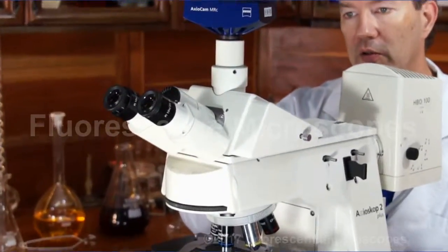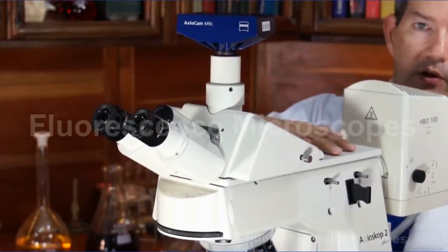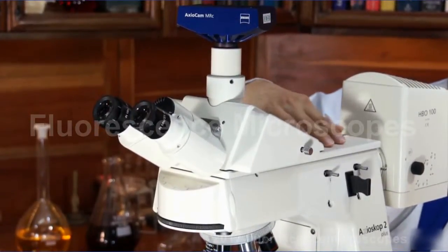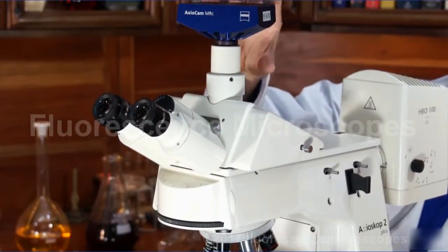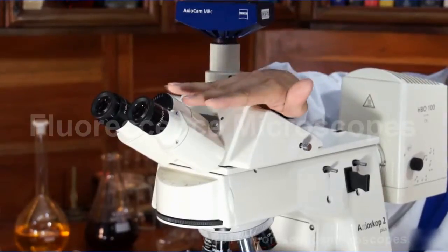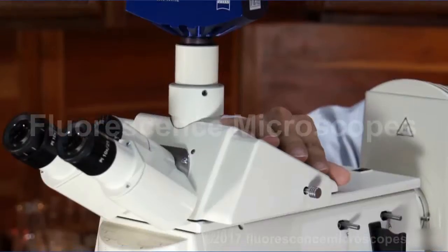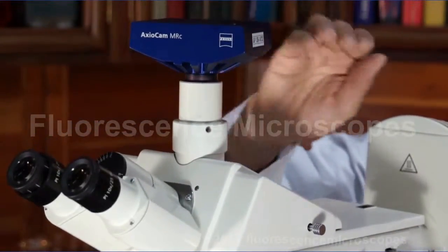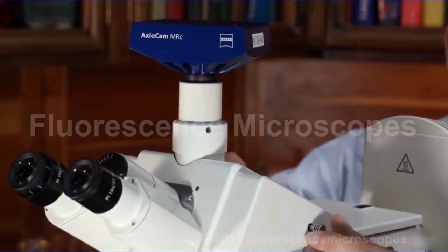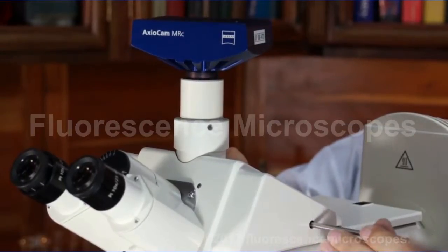They normally use them on the Axial Plans, but they're adaptable to the Axial Scope version as well. It allows 100% of the light to the camera port, or 100% of the light to the eyepieces, or a split with 80-20: 80% of the light to the camera port, 20% to the eyepieces. And this is your three-position knob.